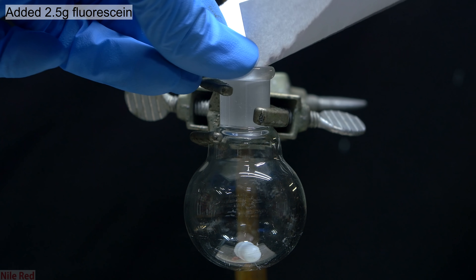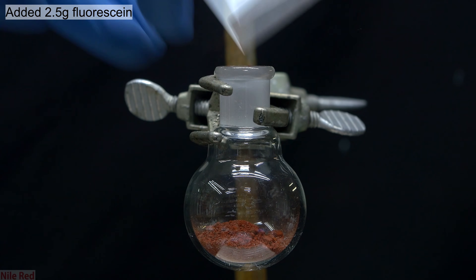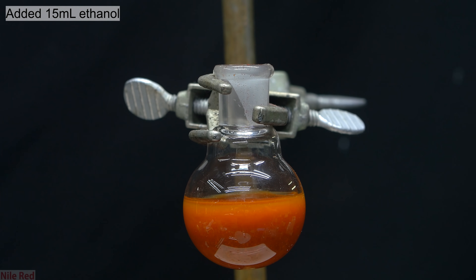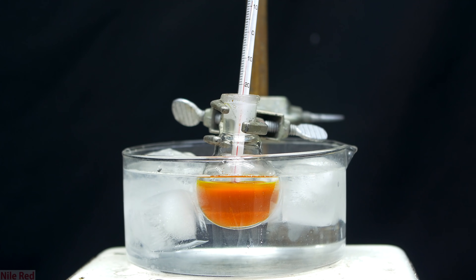To start things off, I pour about 2.5g of fluorescein into a 25ml round bottom flask. On top of the fluorescein, I pour in about 15ml of 95% ethanol. Before mixing, we actually had a kind of cool color gradient going on, but that was quickly disrupted after I set up a small ice bath and got the stirring going.